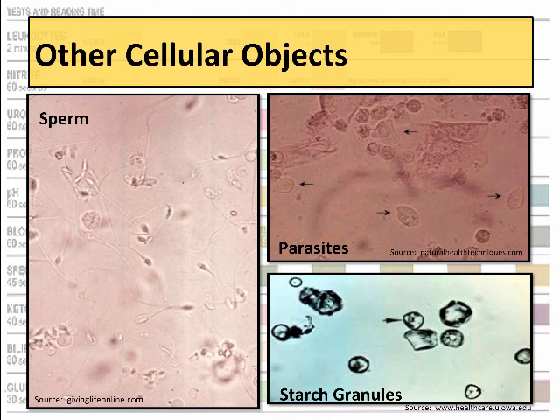And a lot of times if you just focus up and down on your slide, you'll see that perhaps it's not exactly what you think it is. And so just be aware that there's other things besides those cells that might actually be found in the urine sediment.